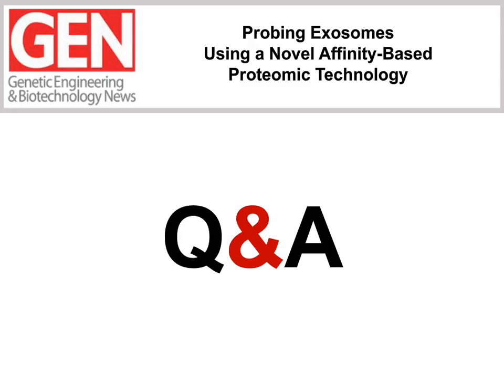Well, it's a Yeoman response. Maybe you want to take a breath because I have another question for you. Do you ever use commercial exosome precipitation kits? If not, why not? If so, how do results compare with ultracentrifugation?